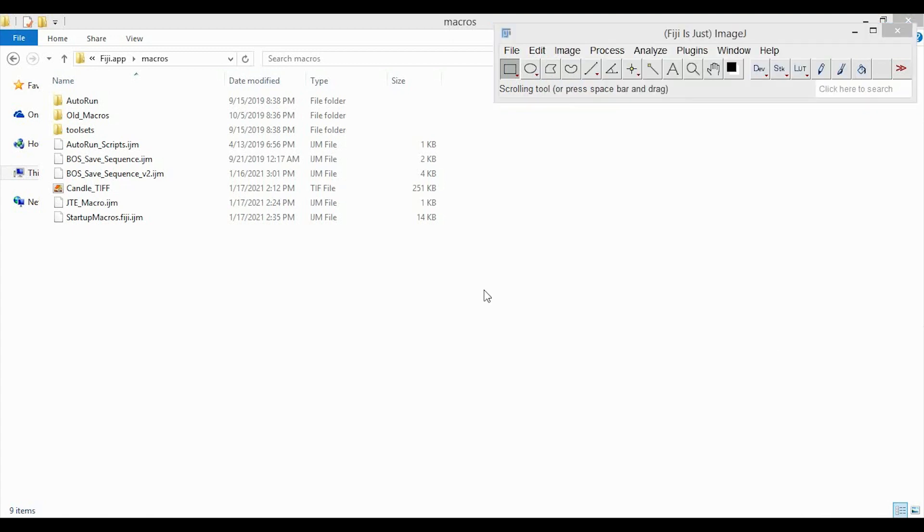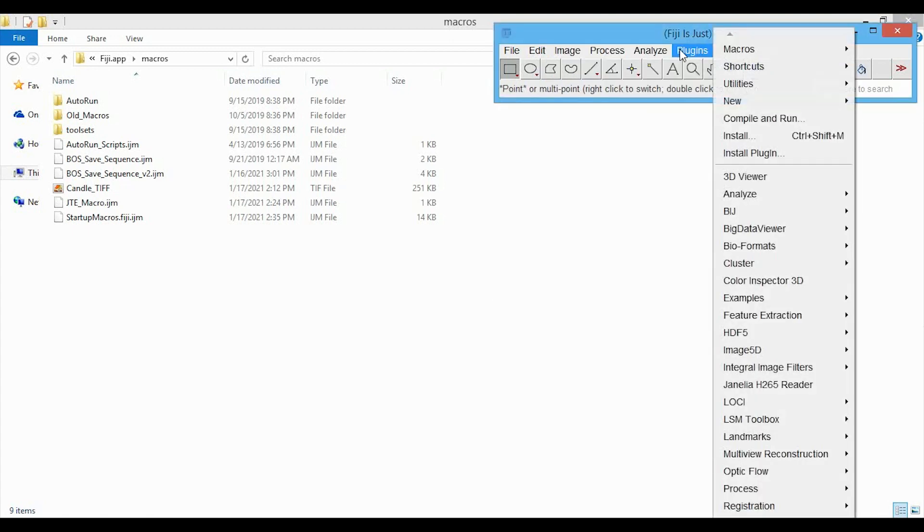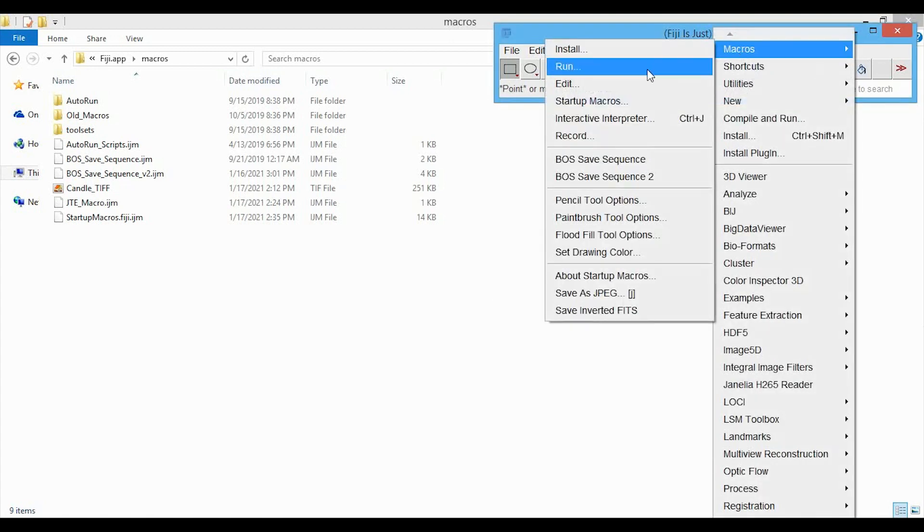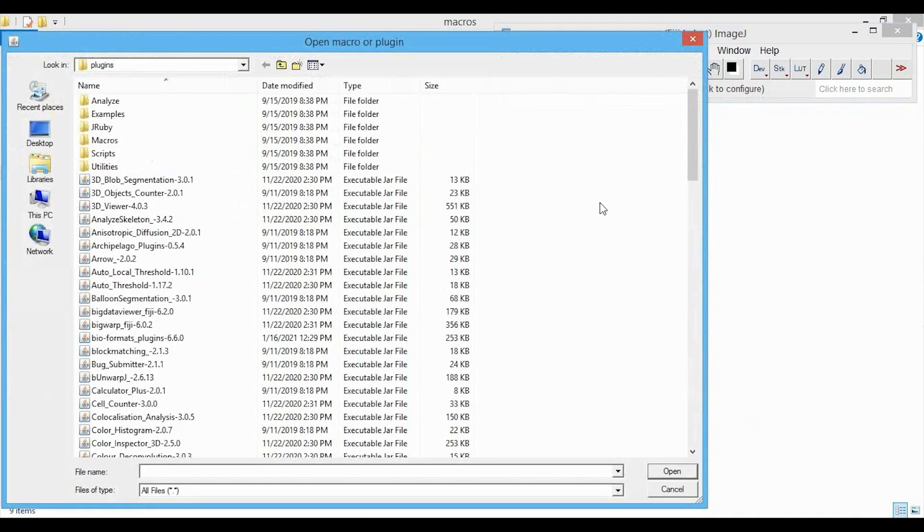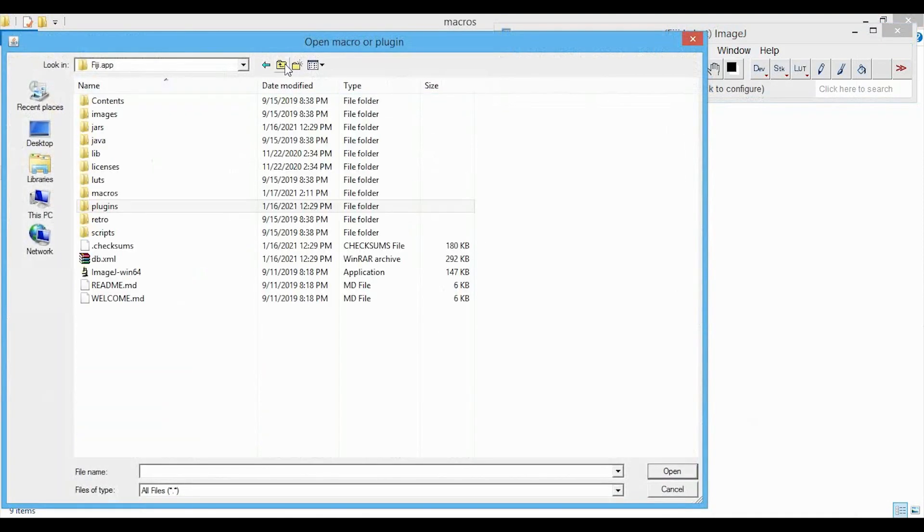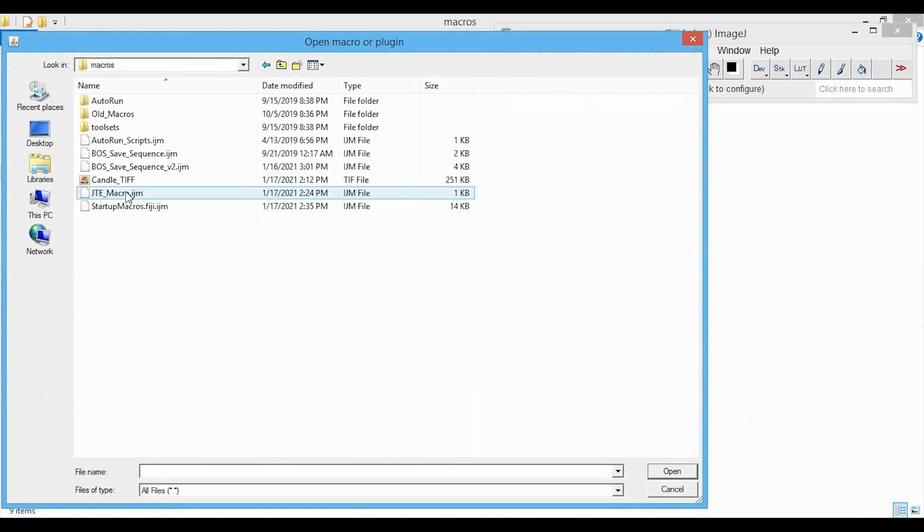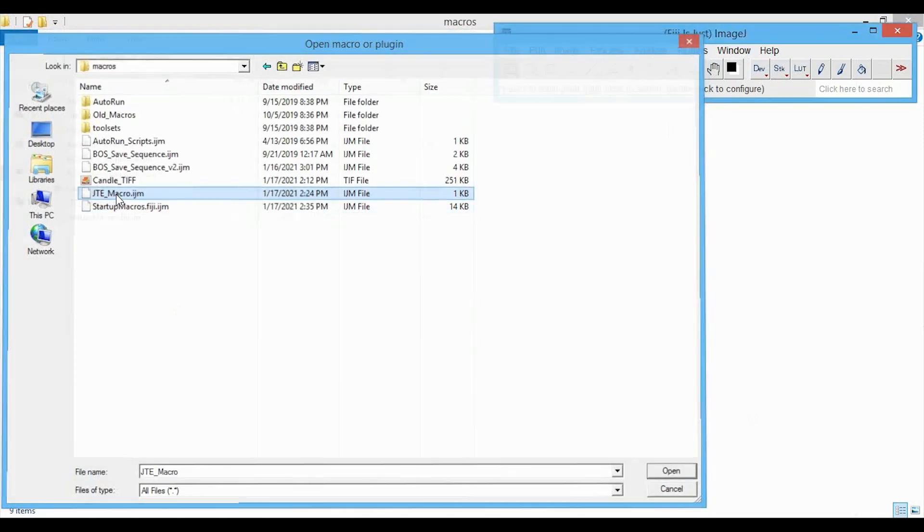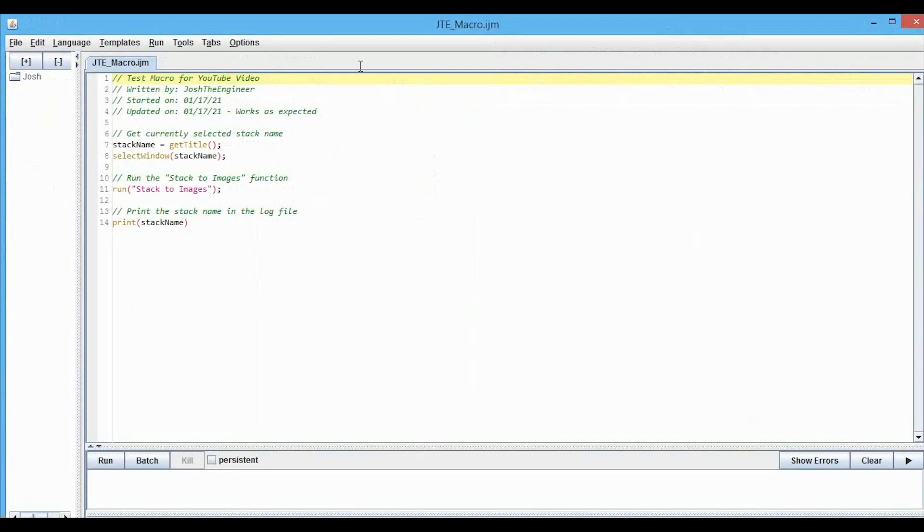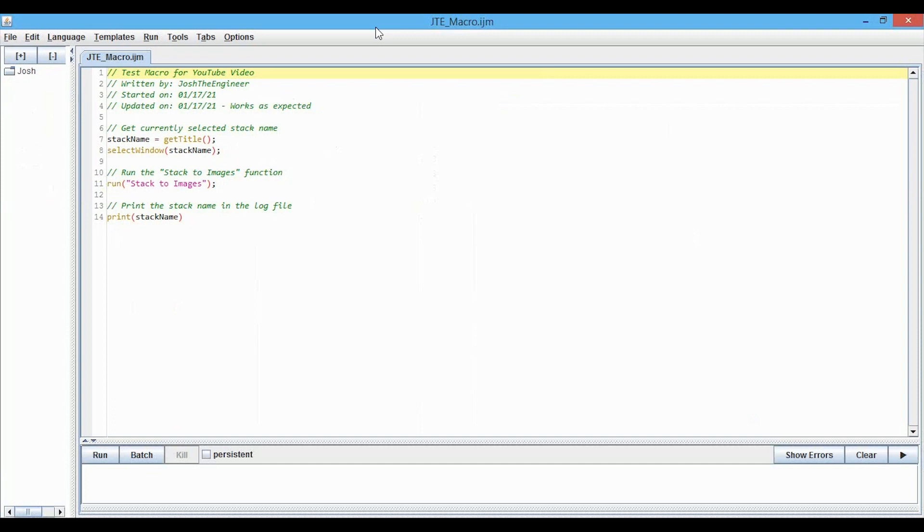First, let's open the macro file for editing. We'll go into Plugins, Macros, and Edit, and we will select... I'll have to go back a page and then go into the Macros folder, and then we can select jtemacro.ijm, and this opens up the macro editor that you see here.